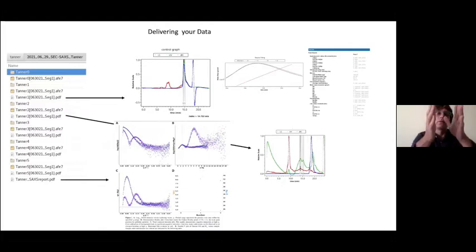You get a small report for SAXS that looks like this, a SAXS report PDF. For each sample, you also get a PDF file for the MALS, UV, and refractive index signal, analyzing the molecular weight across the peak.